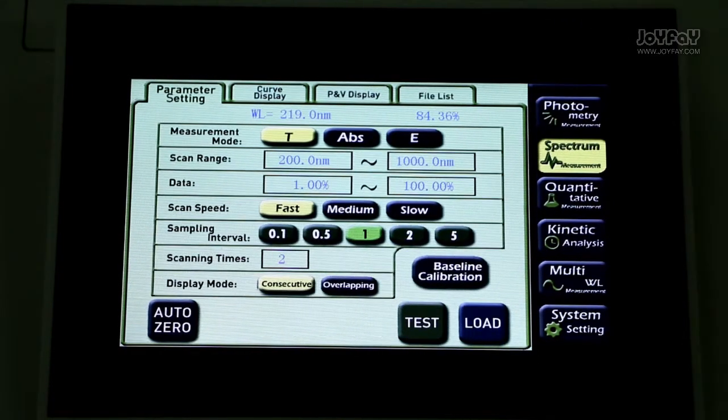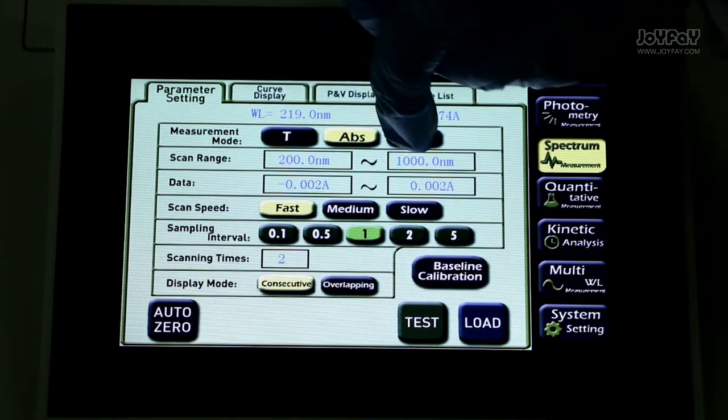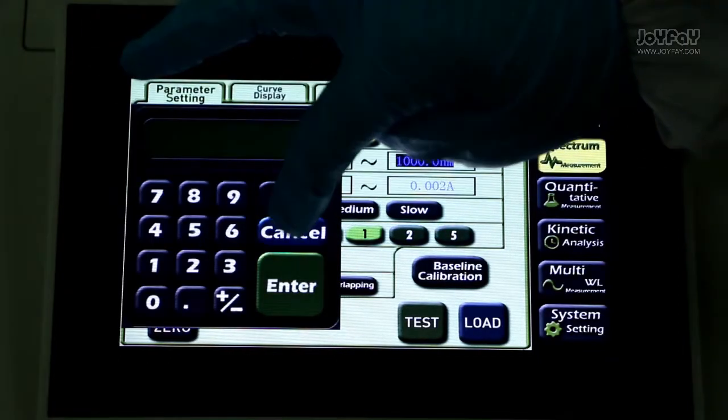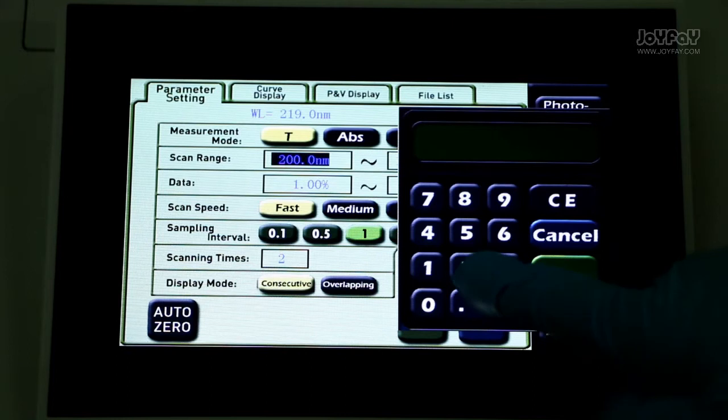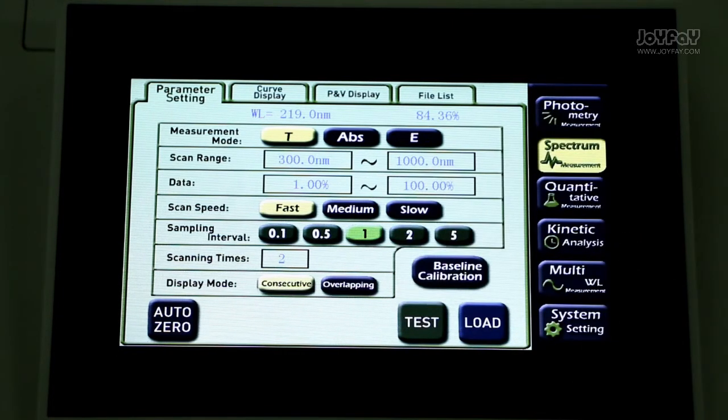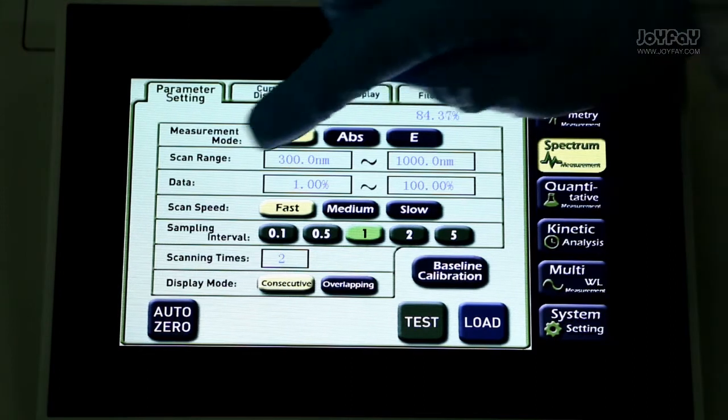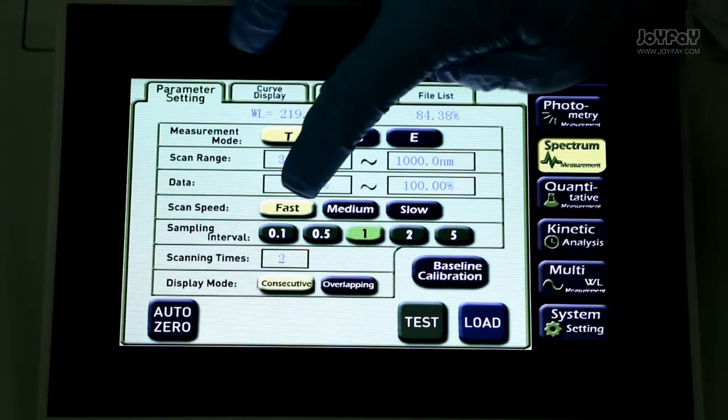Let's come to the first tag. Here are three measurement modes for you to choose, and we choose Mode T as example. Press the blank box beside scan range. Enter the wavelength range you need. Press the blank box beside data and enter what you need.